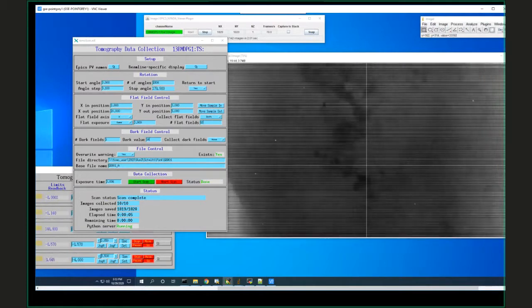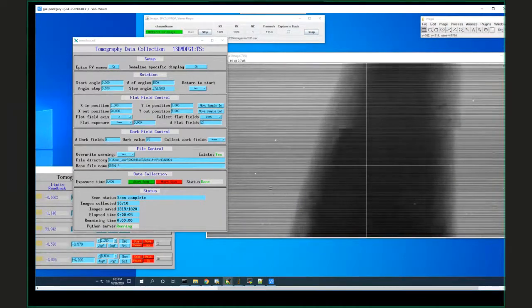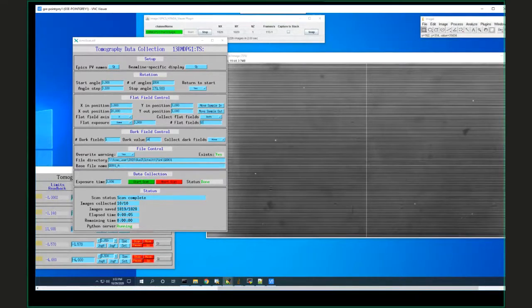I was speaking more also to the choice of scintillator for different resolutions, different phenomena, or data collection or quantification within the reconstructed tomography. Would switching out two particular scintillators give you a contrast in the reconstructions that would give you, let's say, two data points to compare against? No, I don't think the scintillators should really have any effect on the reconstruction.